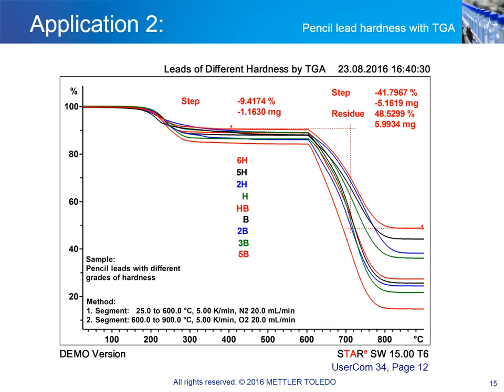Pencil lead hardness is a very important property in pencil production and therefore an important parameter to check during quality control. Pencil leads generally consist of a thermoplastic matrix into which fillers are incorporated to regulate the hardness of the resulting leads. Traditionally, the polymer matrix consists of cellulose, which is slowly being replaced by other thermoplastic polymers. The main fillers are clay and graphite. The amount of clay defines the hardness of the pencil lead, the amount of graphite the darkness of the marking.